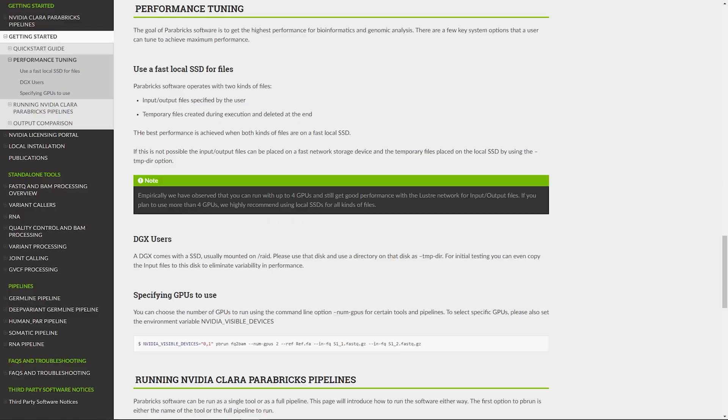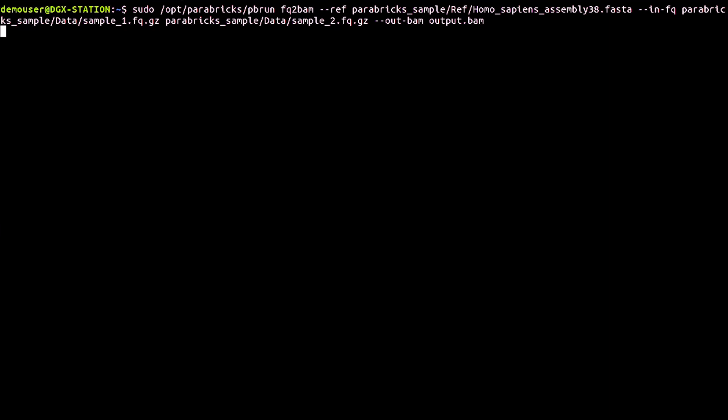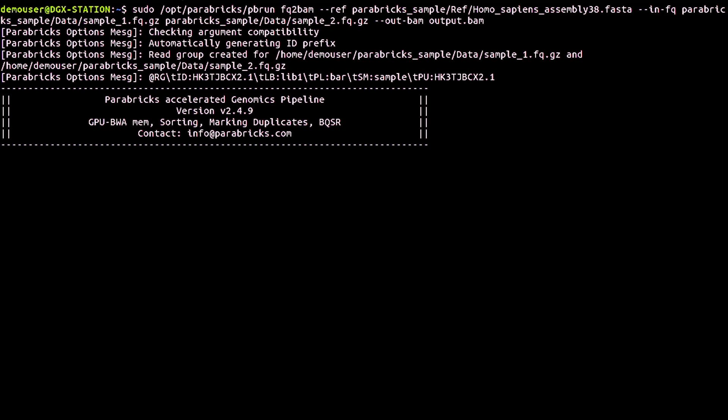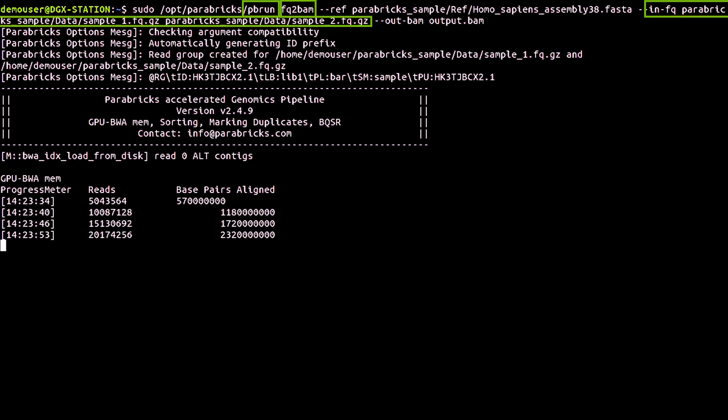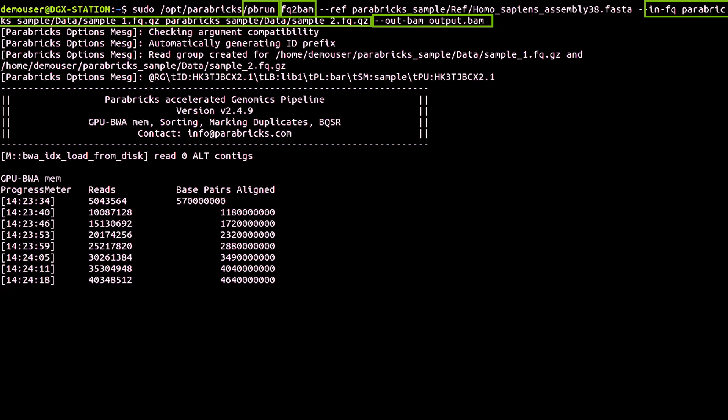Every Parabricks command starts with PBRUN followed by the tool or pipeline name. After that, you can provide tool-specific inputs, outputs, and options.